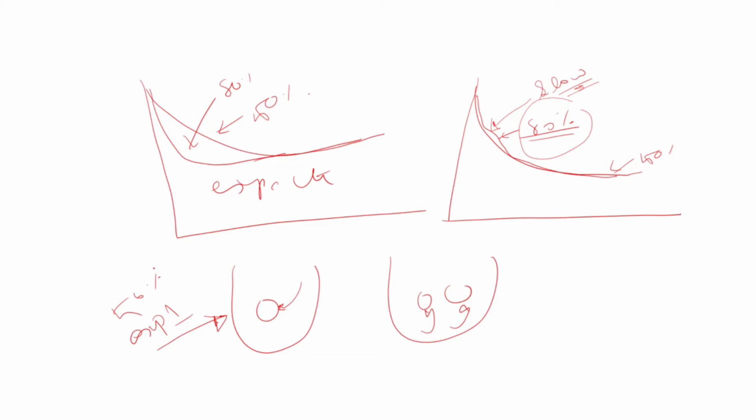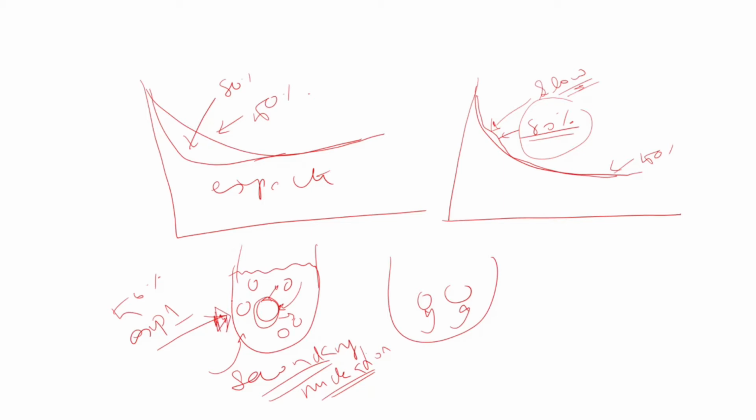In the 50% loading, what I can expect is that once we loaded with some seed crystals, probably it created nucleation. It created too many smaller particles. We call this a secondary nucleation. So mention this in your lab report. Just mention that probably at this particular experiment, due to some external disturbance, or maybe there may be some impurities in the solution, that can trigger this type of events.